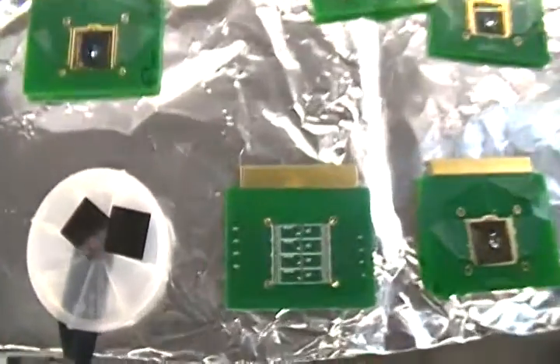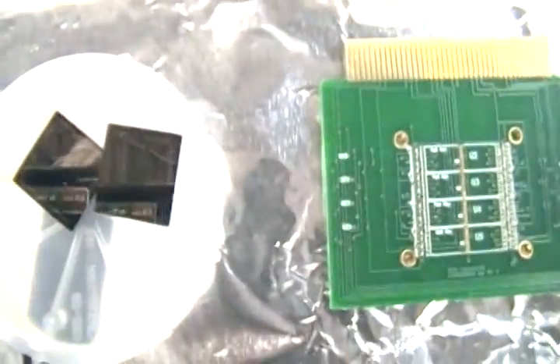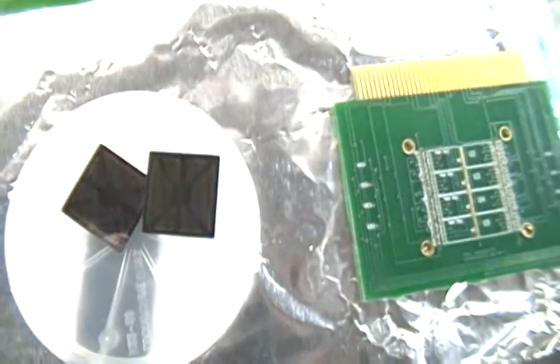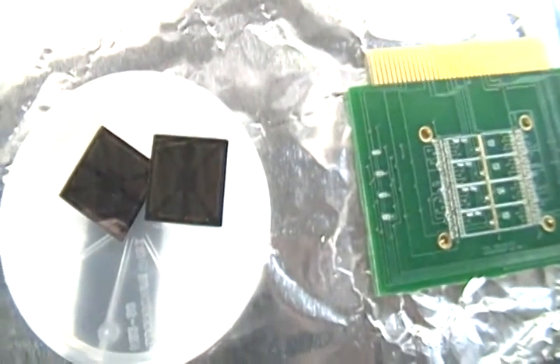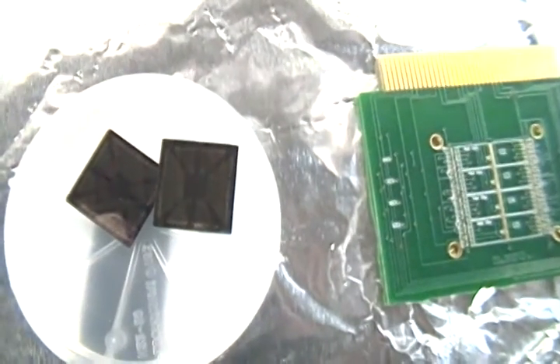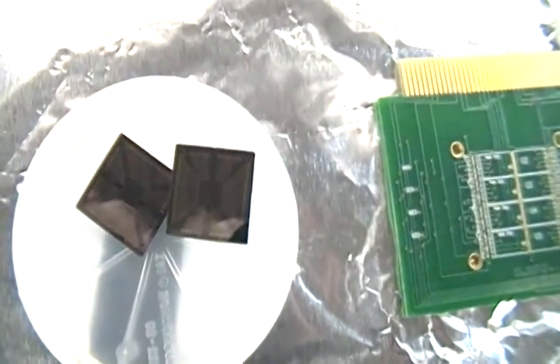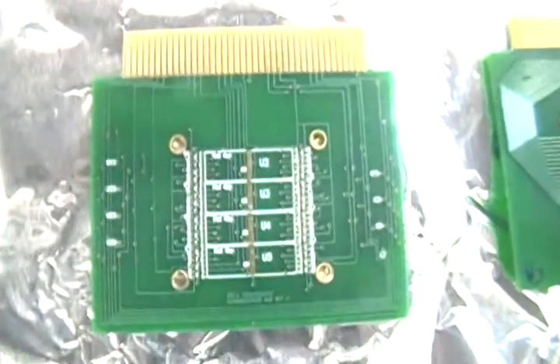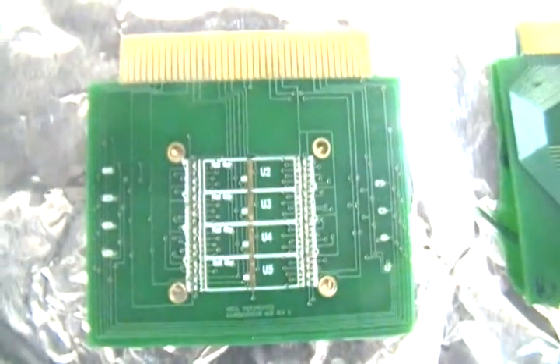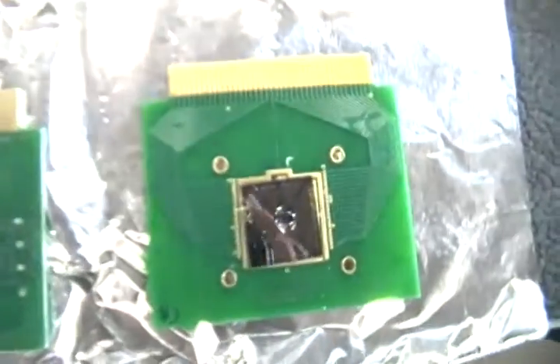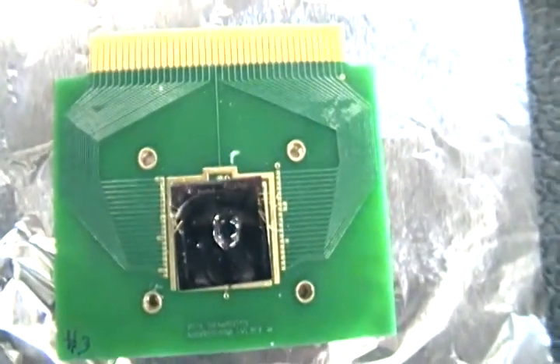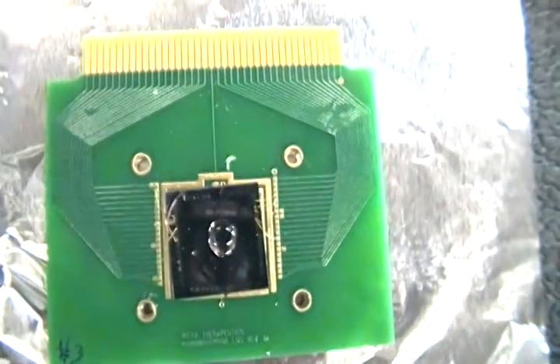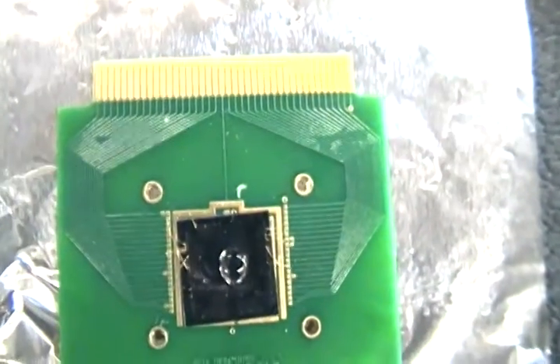Let me briefly just remind you how the system works. Here are actual silicon chips. Down the middle of the silicon chips, there are rows of nanowires. We then identify which of those nanowires are good, and we connect them to a card. We call it a PCB or a nanocard in our case. And then we wire bond. You can see these little tiny wires on some of the circuits. We wire bond them to the card.